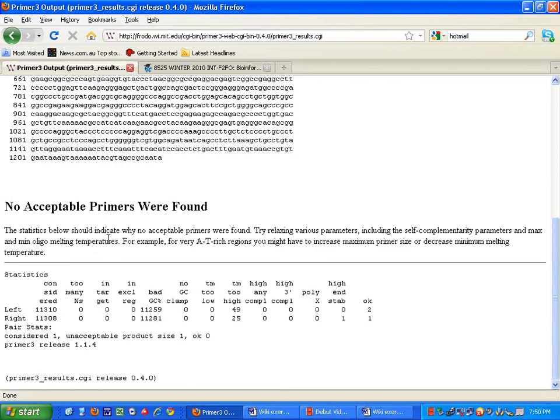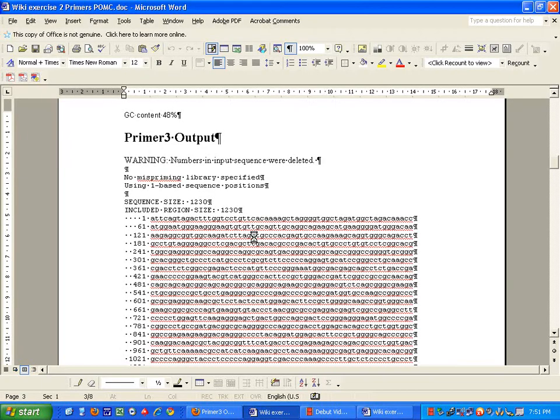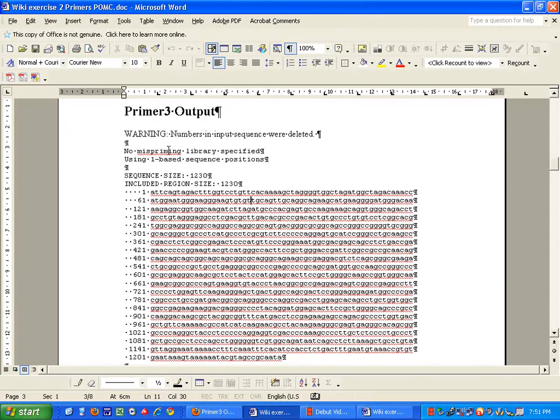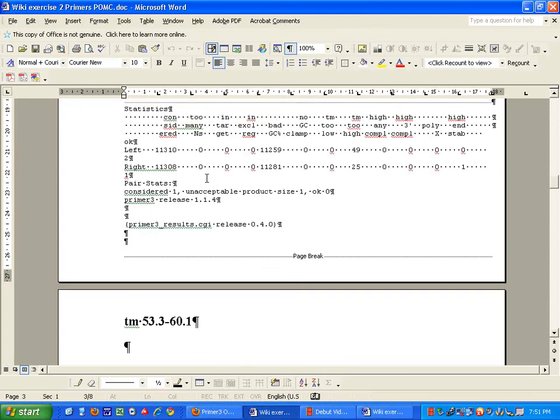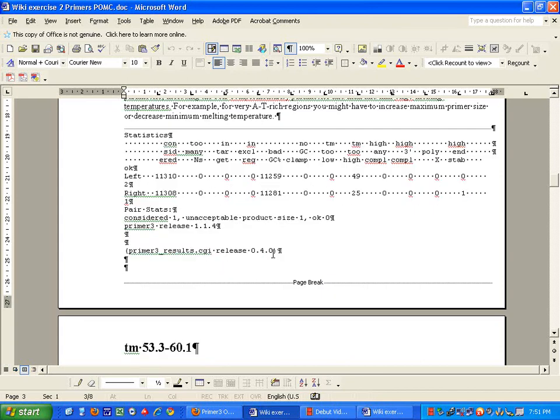As you can see, it says try relaxing various parameters, including self complementarity, max and miligo, and so forth. Now, this is part of what we found, therefore you must document it. And in my another Word document, I have placed what I have found. So, in case I ever need to find that, or look back at it, it's there.